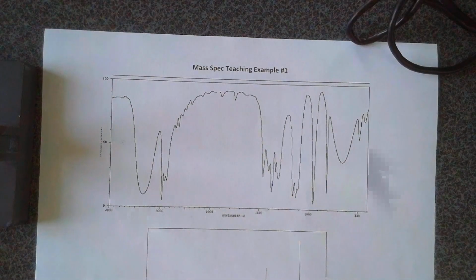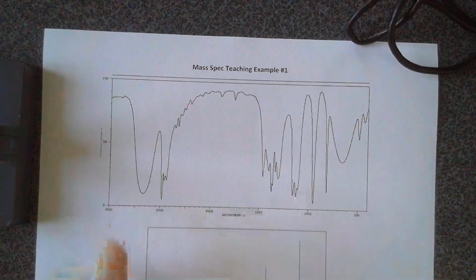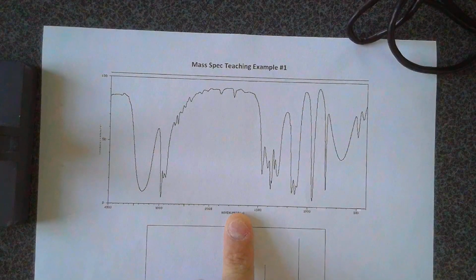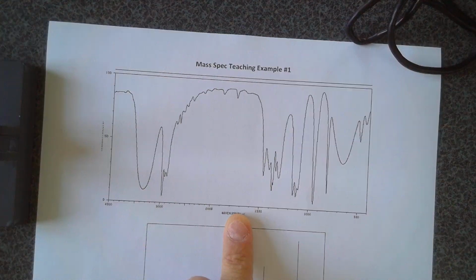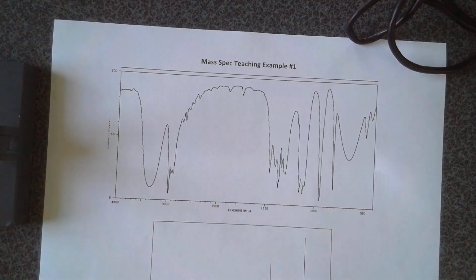The secondary amide. So a secondary amide, you would expect a carbonyl. And if it was a secondary amine, that peak would be way smaller. Oh, yeah, it's like this. Yeah. Okay.